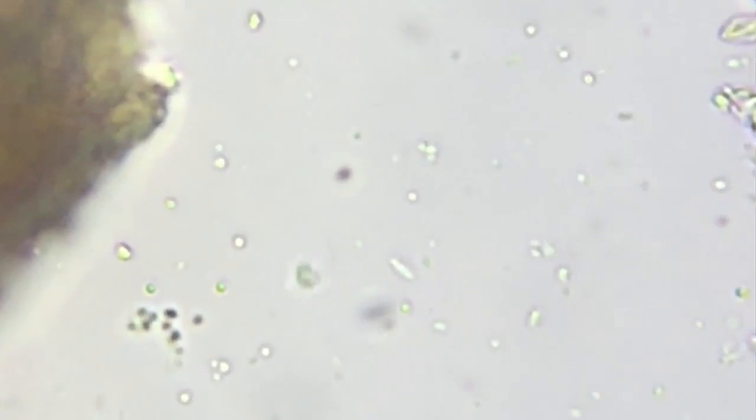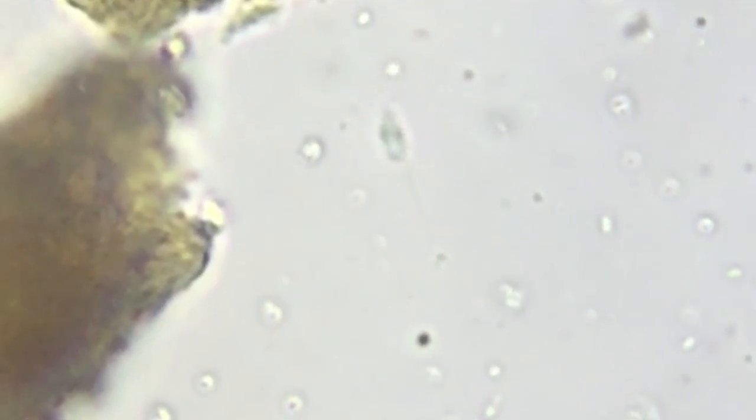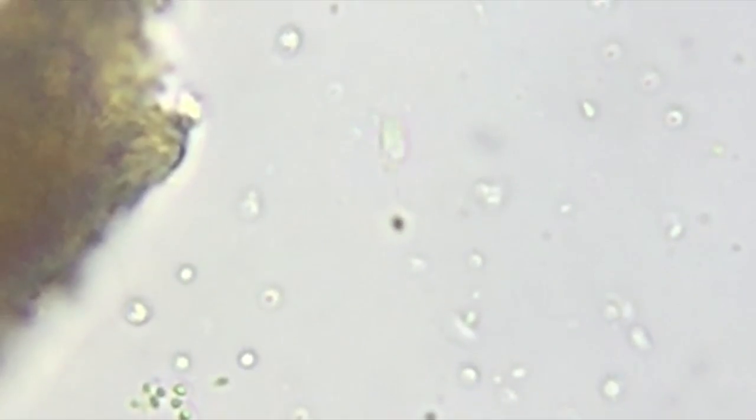This is a flagellate, and I'm videoing it because you can see it has two flagella — one it's kind of moving around with, and one is just trailing.